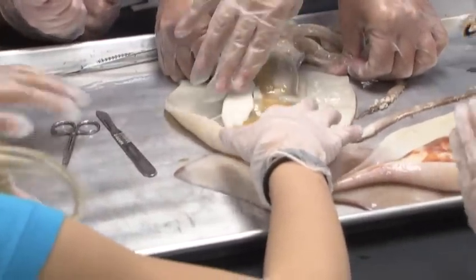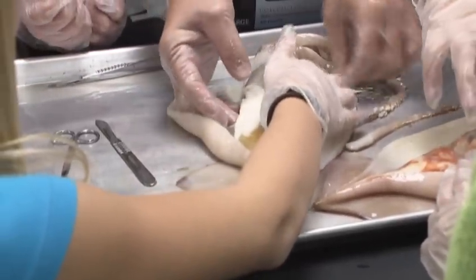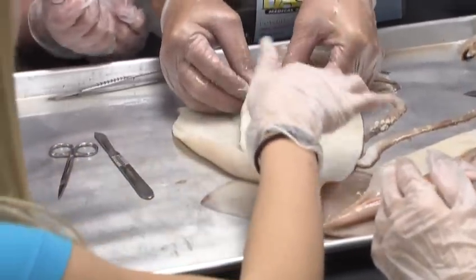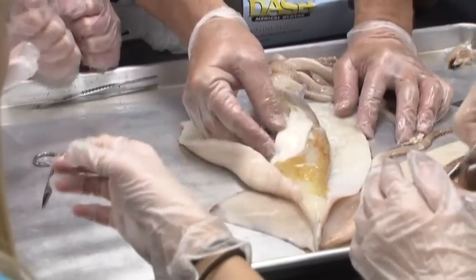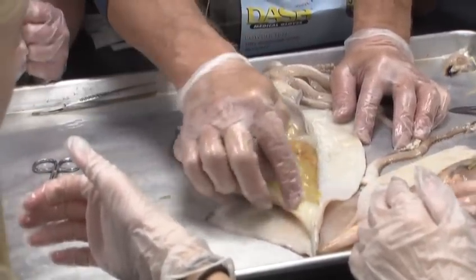Ooh, we are lucky. Yeah, we have a male and a female. This is the girl because you can see these big glands here. And those are the digestive gland. Well, this is all digestive cavity and digestive gland. This is called the nidamental gland. That's how you tell a male from a female right here. These big white glands. And these yellow and red ones are ovaries.